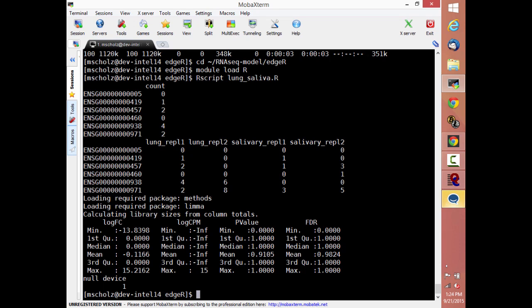So I mentioned that this is using EdgeR. EdgeR is a tool written in the R statistical programming language, which again adds a layer of new things that you get to learn to deal with all of this stuff. So you've already learned a little bit of bash, a whole lot about RNA-seq, 4 or 5 of the tools required for RNA-seq, and now there's EdgeR. EdgeR is essentially a programming language. It has a bunch of functions that you can apply within EdgeR to do different analyses.